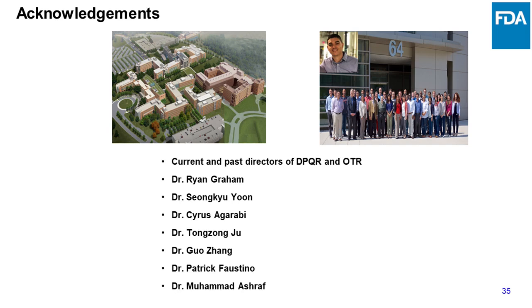So, yeah, I think I mentioned this before. I don't think you need to have a new method for each media, as long as you're only looking at the same metals that are in your method. But if you add a new metal, then you might have to make a new method. Otherwise, you can just change the dilution factor and it should work.